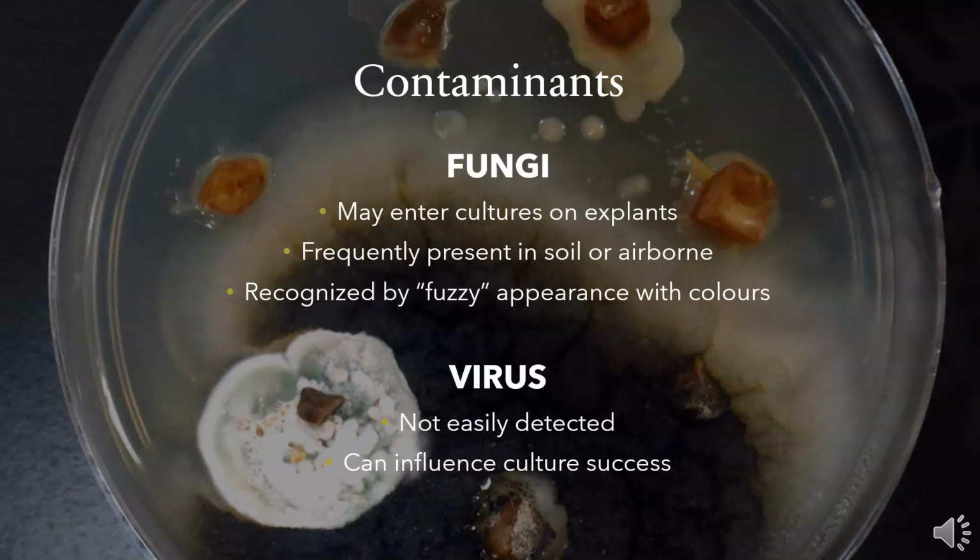The next type of contaminant is viruses. Viruses are extremely small, and not easily detected. Therefore, plant cultures are not necessarily pathogen-free even if microorganisms are not visible, and viral contamination can significantly influence culture success.